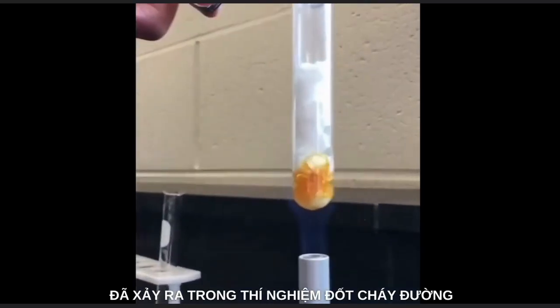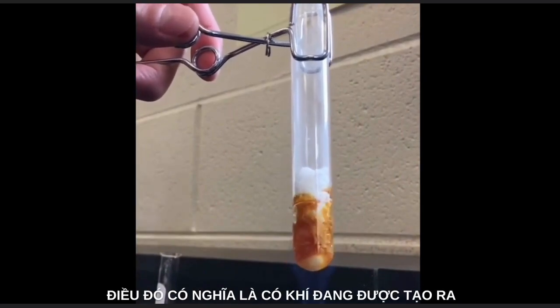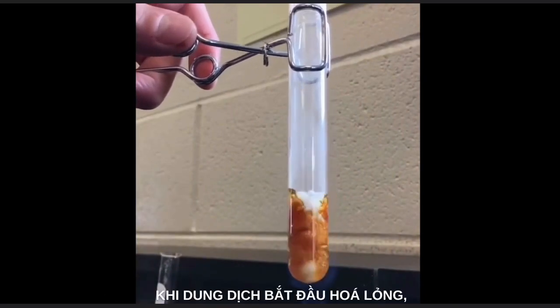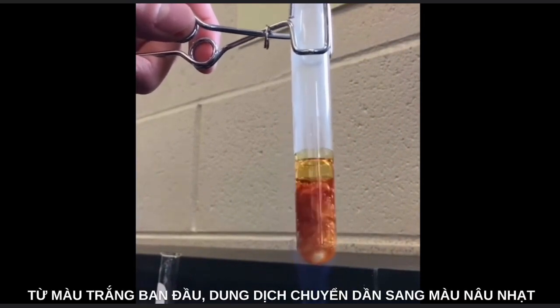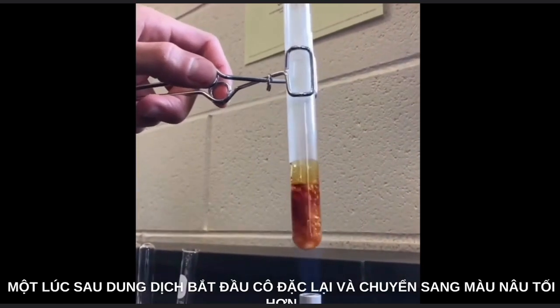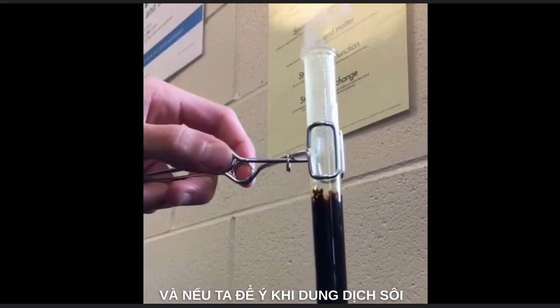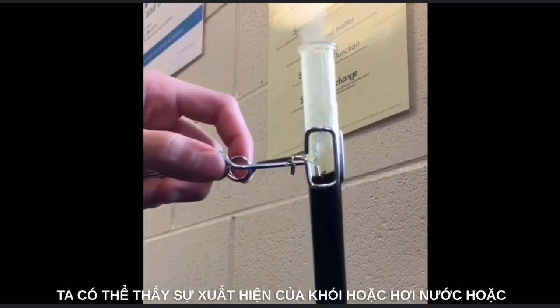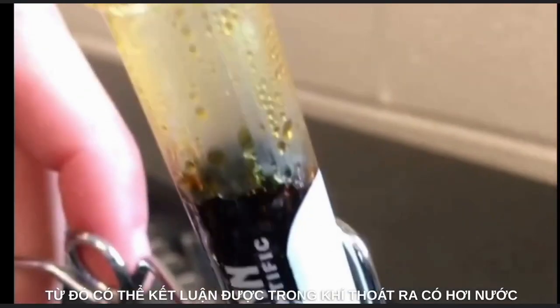When we burned the sugar, it quickly turned to a liquid. It was bubbling, so that means there was a gas being produced. As it turned to a liquid, it also became a little discolored. It was no longer white, it became kind of a light brown, and as it started to thicken, it became a darker brown. And what we noticed is that as it was burning, there was also some production of steam or smoke or other things coming out of the test tube. What we later found out was that the steam was water droplets on the edge of the test tube.